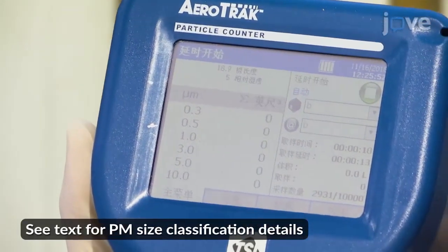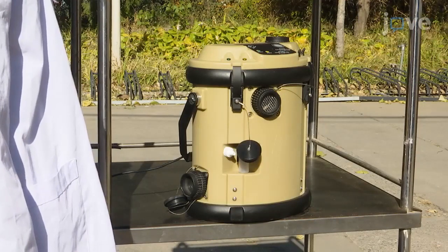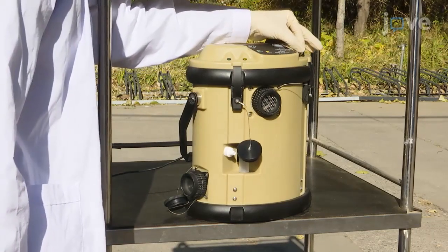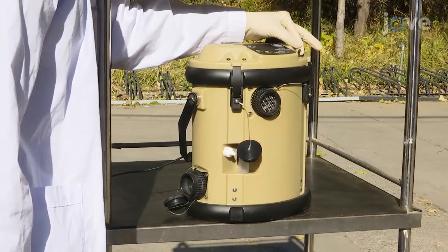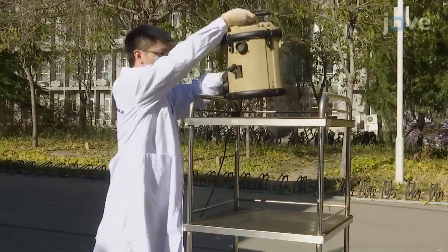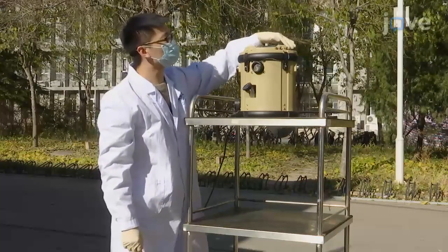every 5 minutes. To collect particulate matter samples by cyclonic aerosol samplers, set a cyclonic aerosol sampler to collect a sample flow of 323 liters per minute for a 6-hour collection period, and use the automatic cleaning function to wash the inside of the sampler 3 times with sterile water. Then, place the sampler alone on a shelf or floor and start the collection.